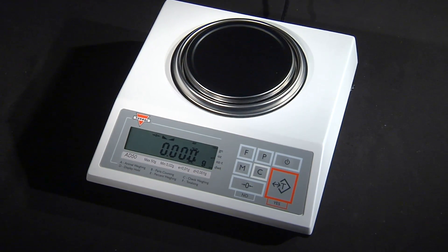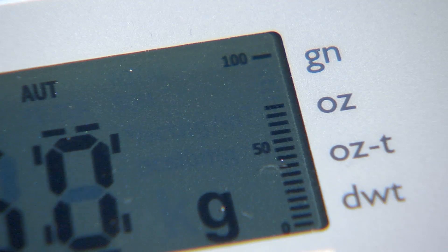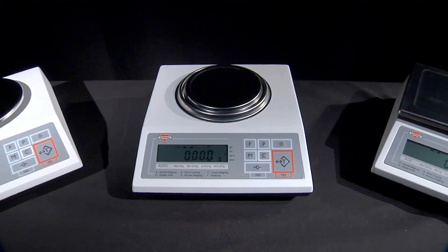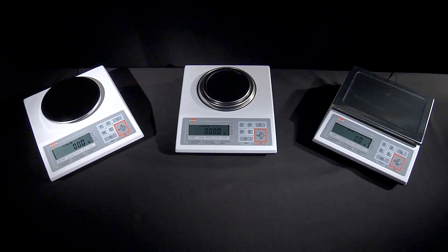All scales are equipped with a used capacity indicator that shows the amount of the scale's capacity used during weighing. This allows the user to avoid exceeding the maximum capacity of the scale.